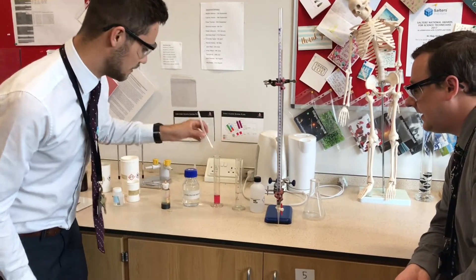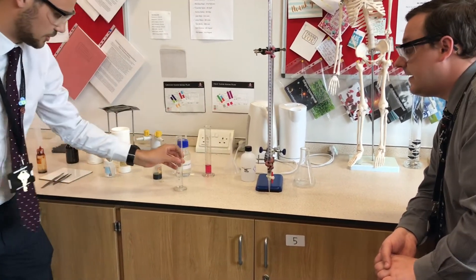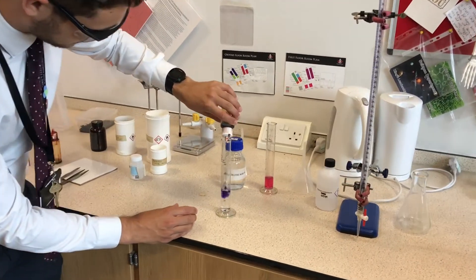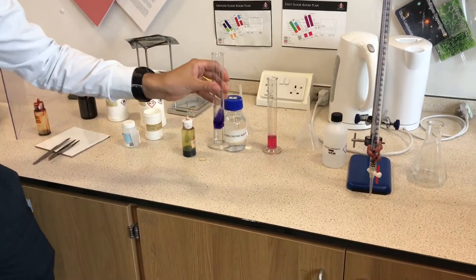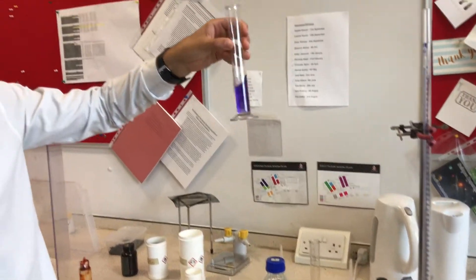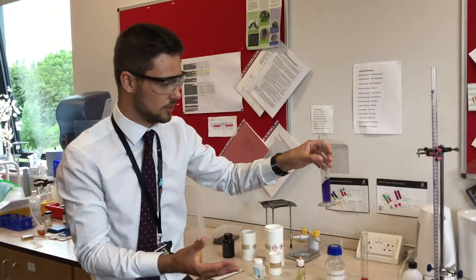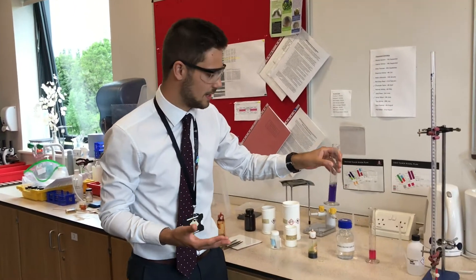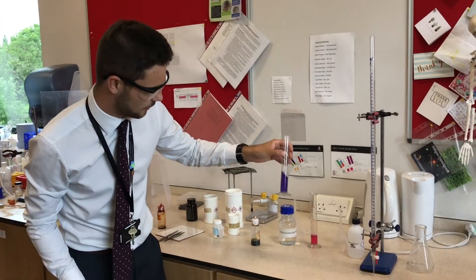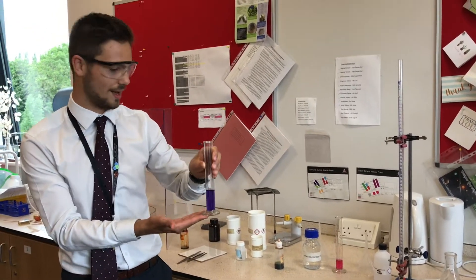Moving over to sodium carbonate — let's see what sodium carbonate is. Straight away we see that purple colour coming through — a strong alkali. Really, really strong purple there, rather than a light blue which would be a slightly weaker alkali with fewer OH⁻ ions. This has lots of OH⁻ ions and is a strong alkali.